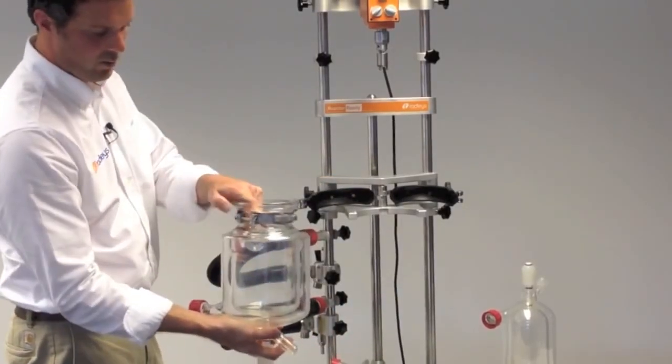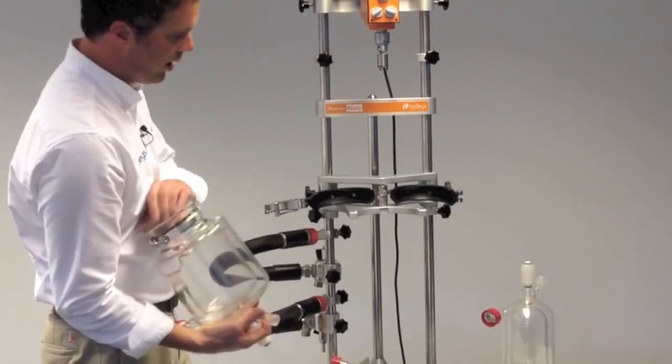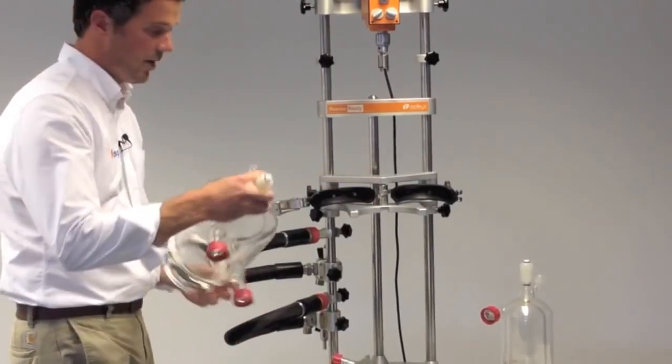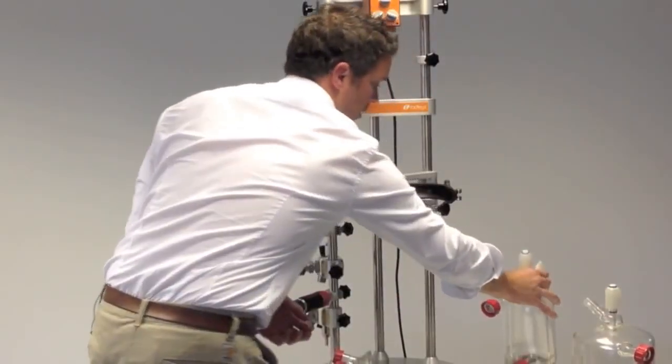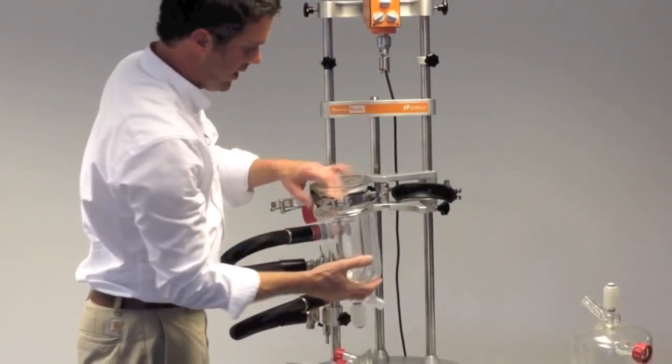The vessel's just hung with a stainless steel support collar that sits in the lugs on the Reactor Ready framework. I'll just drop in the 1 liter vessel.